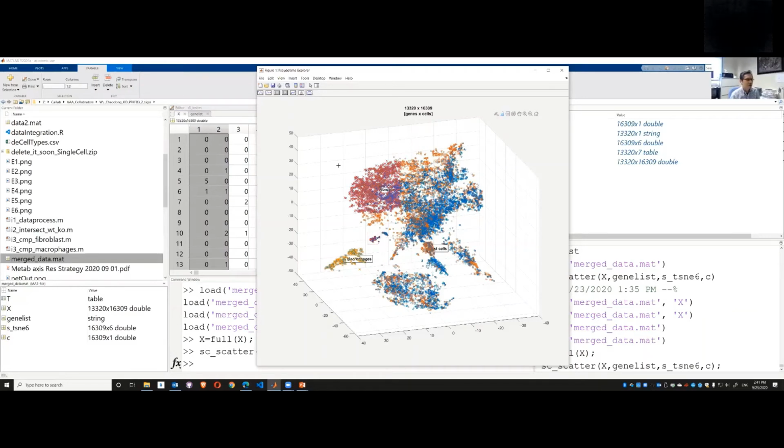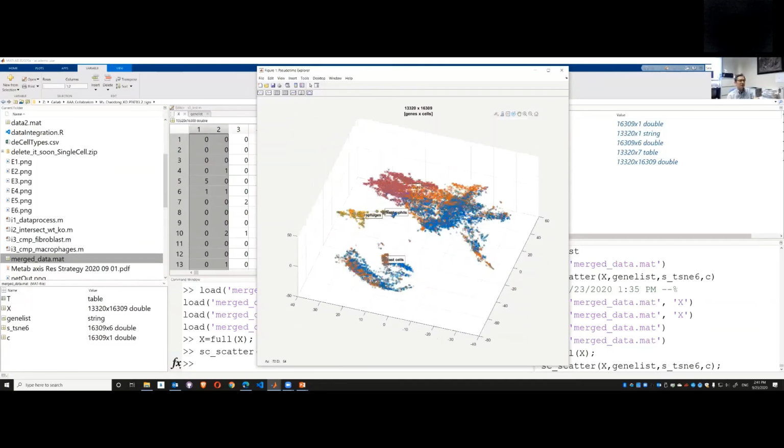Only my collaborators know where they come from, but I can try. I can say this is neutrophils. Okay. Yeah, so there are high-level applications. You don't know what's behind the coding, but the function is there, and also this very nice interaction.